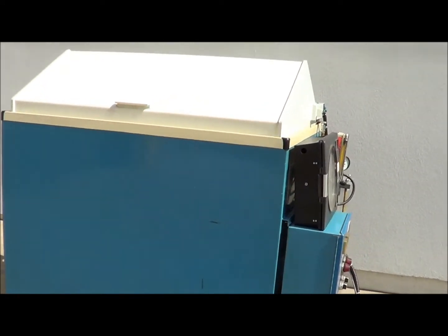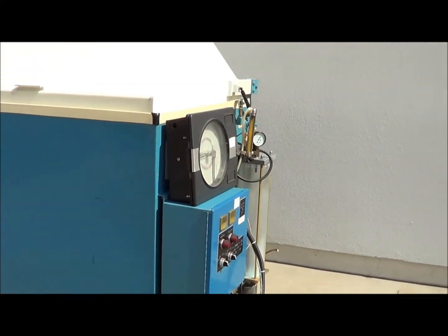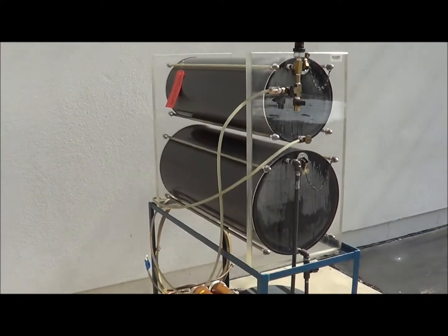It's a 220 volt system on this particular unit. Here to the side you can see the reservoir towers.